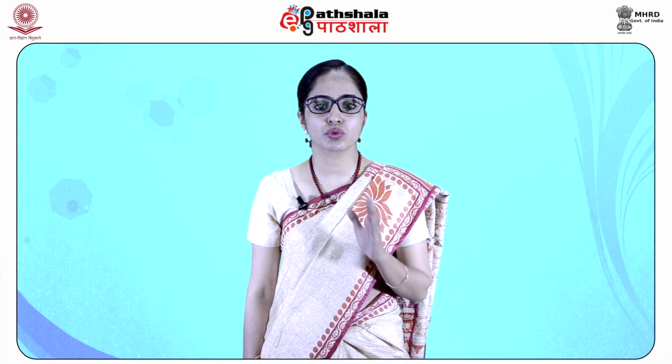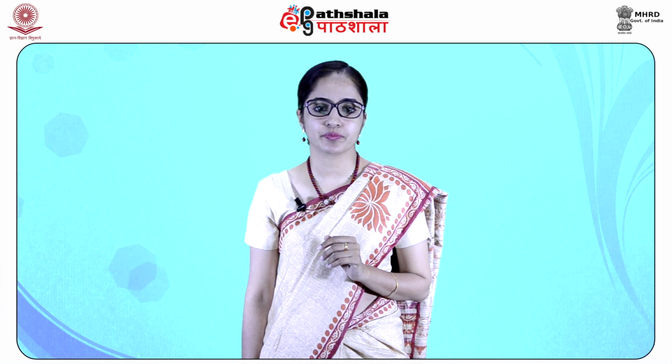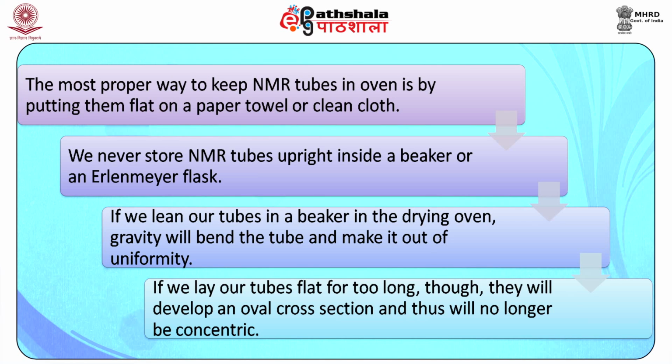An alternative method is to blow nitrogen or air through the tube while warming it gently for a few minutes with a heat gun. Do not dry NMR tubes in a hot oven, that is above 100 degrees Celsius, as the high temperature may result in deforming the NMR tubes. The most proper way to keep NMR tubes in an oven is by putting them flat on a paper towel or a clean cloth. We never store NMR tubes upright inside a beaker or an Erlenmeyer flask.